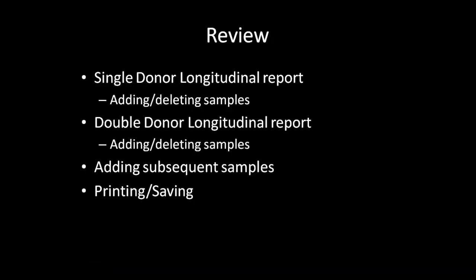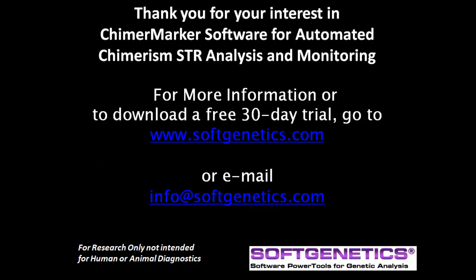We covered both single and double donor longitudinal reports. The longitudinal report is flexible, allowing you to add or delete samples given that you have the appropriate user management rights. We also discussed how subsequent samples are added to the report, and the different display preferences for printing and saving. Thank you for your interest in ChimerMarker software for automated chimerism STR analysis and monitoring. For more information or to download a free 30-day trial, please visit www.softgenetics.com or send an email to info@softgenetics.com.